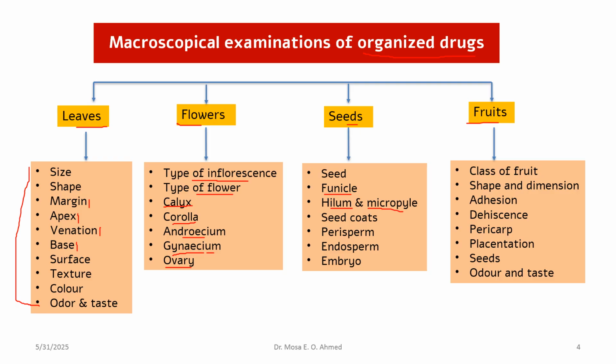Both of them are scars on the surface of the testa, while the hilum is a spot for the joining between the seed and funiculus inside the fruit, the attachment between the seed and the fruit through the funiculus. This is the hilum, a scar left by removal of the funiculus, while the micropyle is a small pore in the testa surface through which the pollen grain enters into the ovule for fertilization.